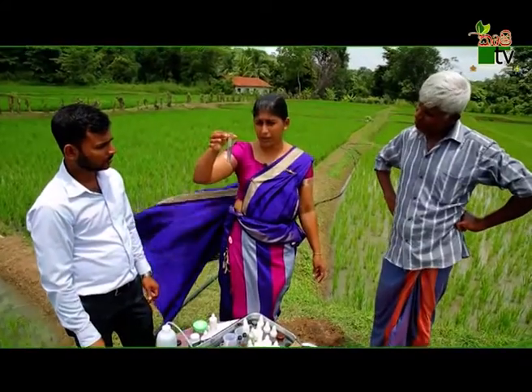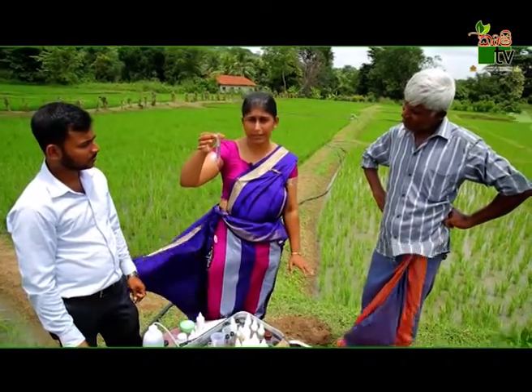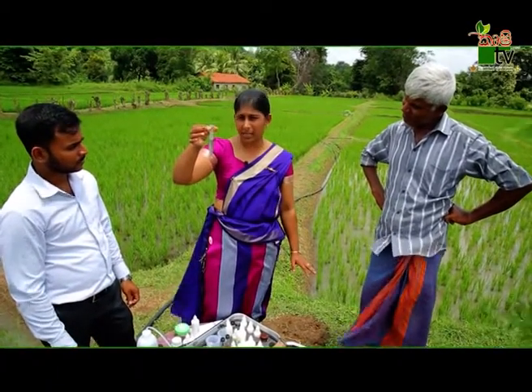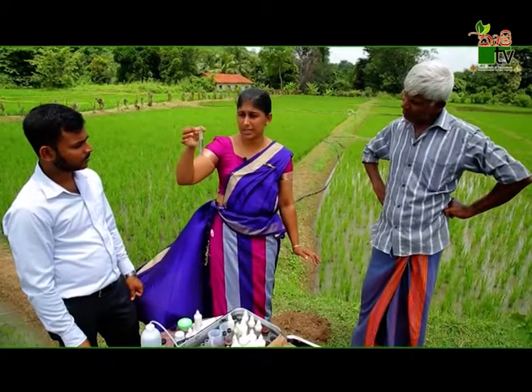We have to be able to get a lot of this. But the samples are not used to be able to get a lot of this. So we have to be able to get a lot of this.